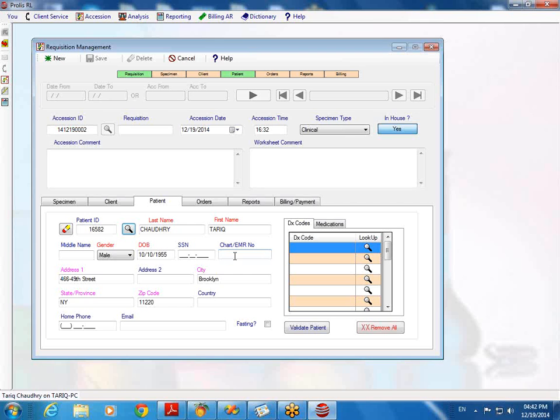No, it doesn't have. Because right now, what was submitted to Prolis, it is assumed that it's the ownership of the laboratory. We don't have such a scenario. We have not come across any situation like that before. So there's no capability of returning the sample to the user. Well, we're just wondering if the ability to capture that data is available.